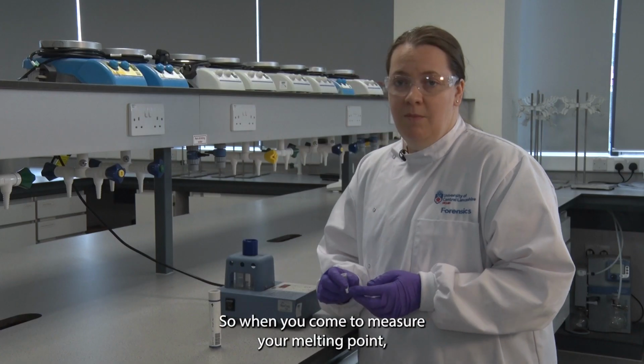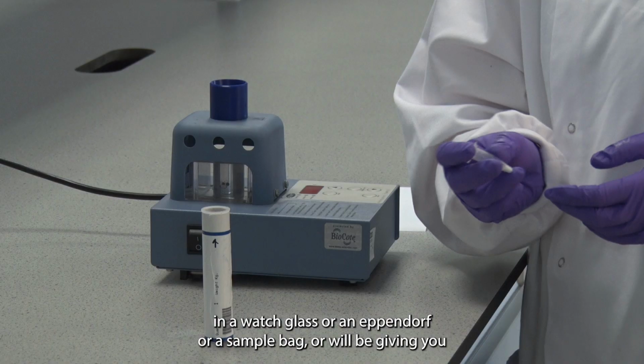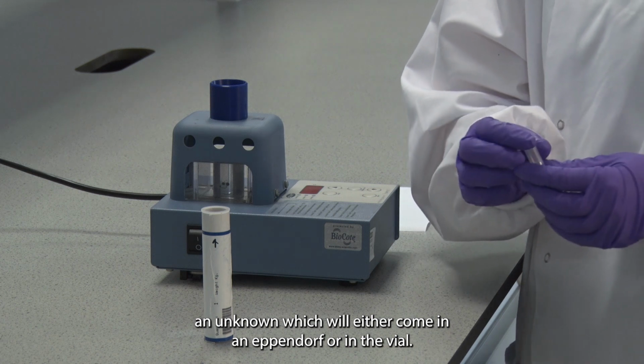So when you come to measure your melting point, you'll either have something that you've made in a watch glass or an Eppendorf or a sample bag, or we'll be giving you an unknown, which will either come in an Eppendorf or in a vial.